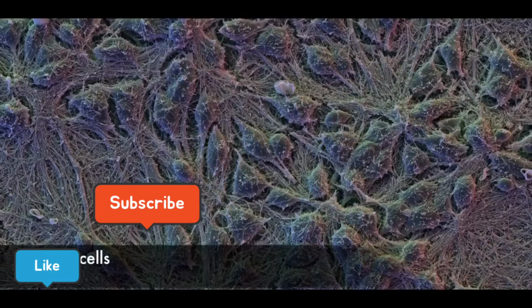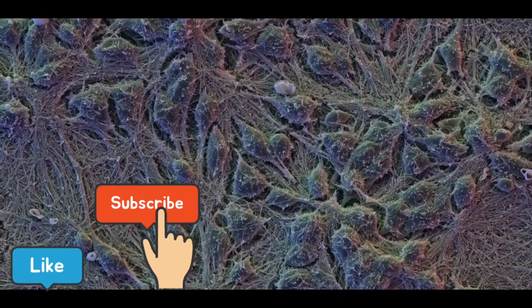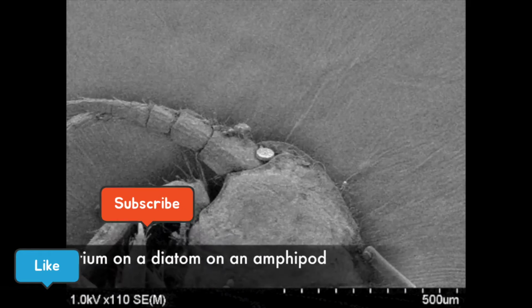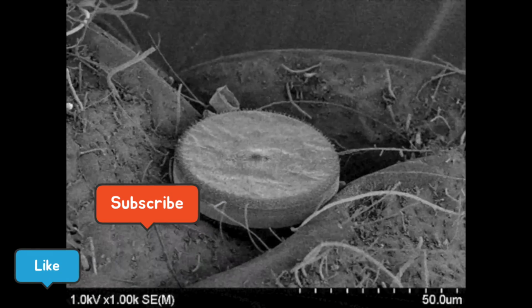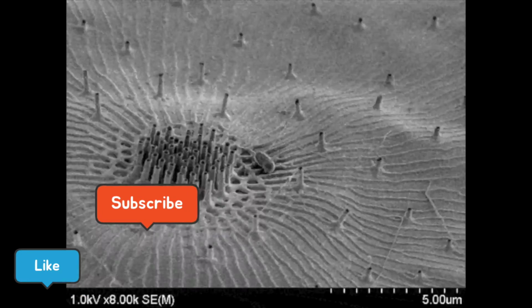Human cortical neurons, or brain cells, show in an extensive network of interconnecting dendrites. Cortical neurons make up the brain's cortex, or gray matter. The final stop of this zoom, which spans multiple orders of magnitude, is a little bacterium. That bacterium is resting on a diatom. The diatom is in turn sitting on an amphipod, a type of shell-less crustacean.